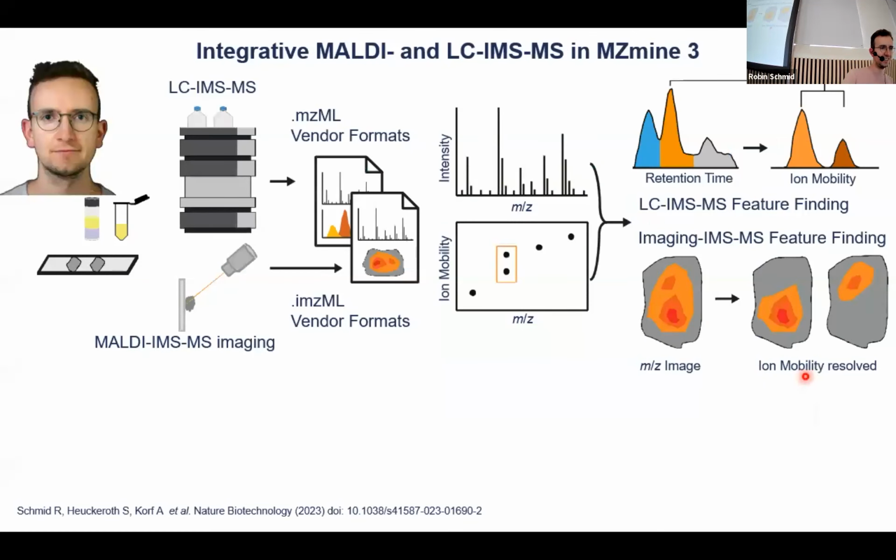At some point we were like, okay, now since we have the ion mobility dimension, and we also support imaging, let's use the imaging and mobility data to align LC and ion mobility data. Then we can align not just on mass to charge, but also on the mobility values, which gives us higher confidence, because then we have two variables that we can assign our molecules on.